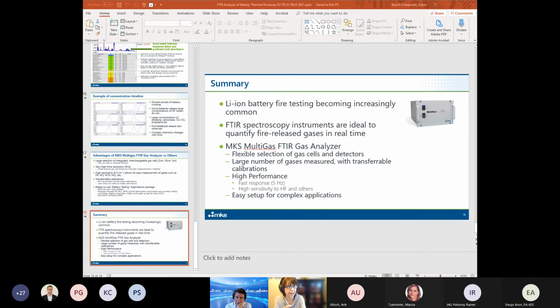Sulfuric acid, fortunately, we have not seen in battery. Obviously, battery makers are probably very aware that they want to avoid any path where sulfuric acid can be produced, because that would be very bad. And we have not seen it, but I'm sure that's part of what the R&D that people are doing.